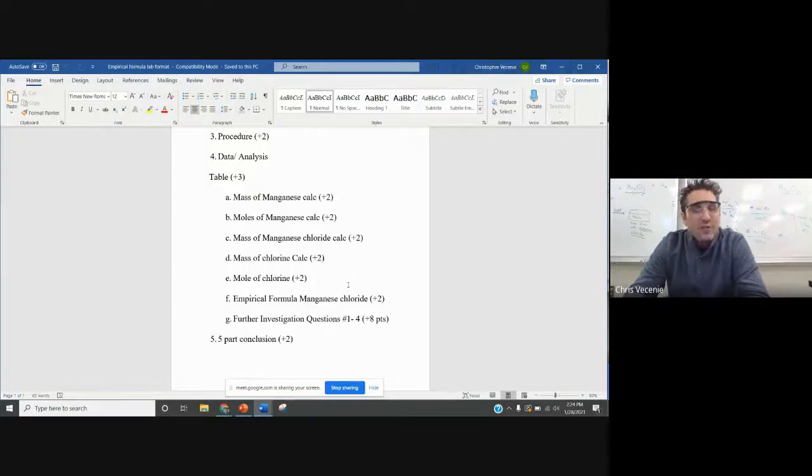Number 5 gets you back to electronic: the 5-part conclusion. And remember your steps to the 5-part conclusion. One, restate the purpose. What were we trying to accomplish? Two, did you fulfill the purpose and how? Three, how does this relate to class? Four, what are some sources of error? What would make me not get the right mass that I was supposed to, or the right formula I was supposed to? And then lastly, difficulties. And obviously you guys won't have any of those because I was conducting the experiment. You guys physically didn't do it.